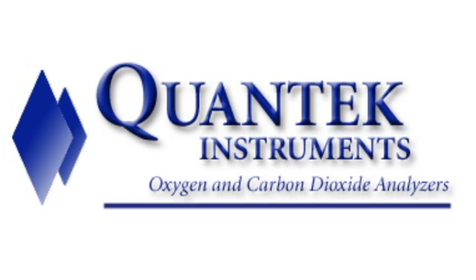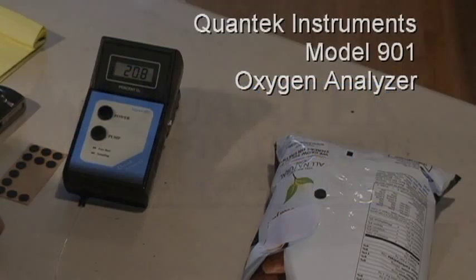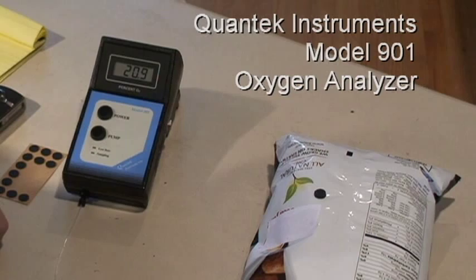The following is a demonstration of the Quantec Instruments Model 901 Oxygen Analyzer, which is used for testing residual oxygen levels in all types of modified atmosphere food packages.